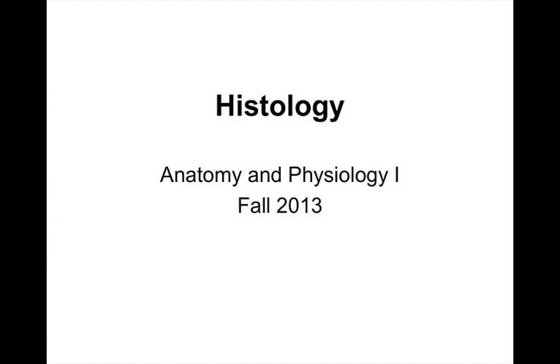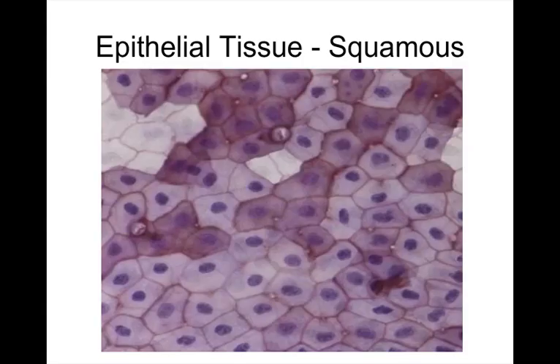We're going to talk a little bit about the slides that we looked at in the first laboratory, with some tips and tricks for identifying them. So let's start right off. What are we looking at here?